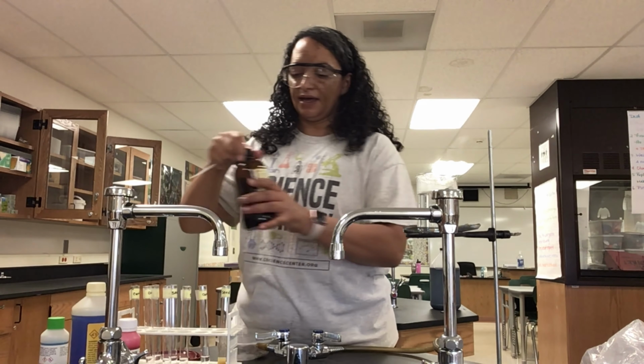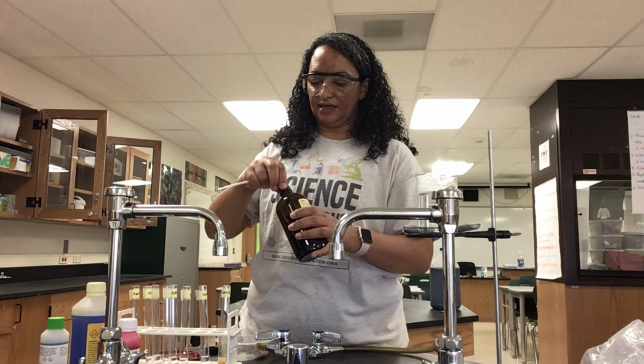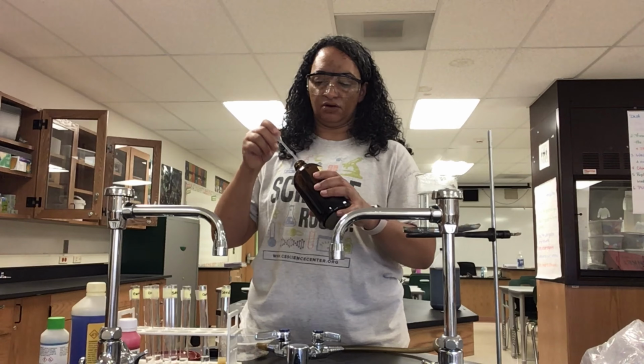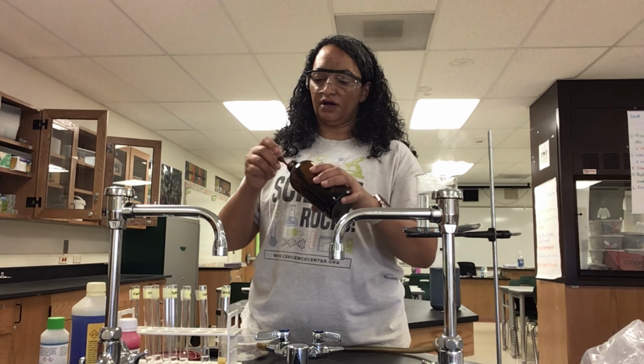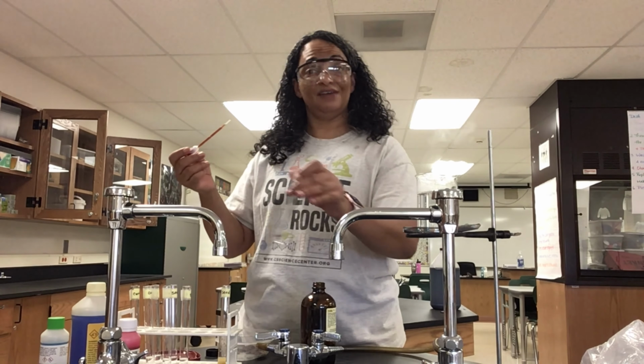I'm going to grab my iodine, which I have to laugh because there's a pipetter stuck in the iodine. We always want to be careful with iodine because it will stain your skin and your clothes. I learned that lesson the hard way when I spilled an entire container of it on my jeans one day. My favorite jeans, for the record.